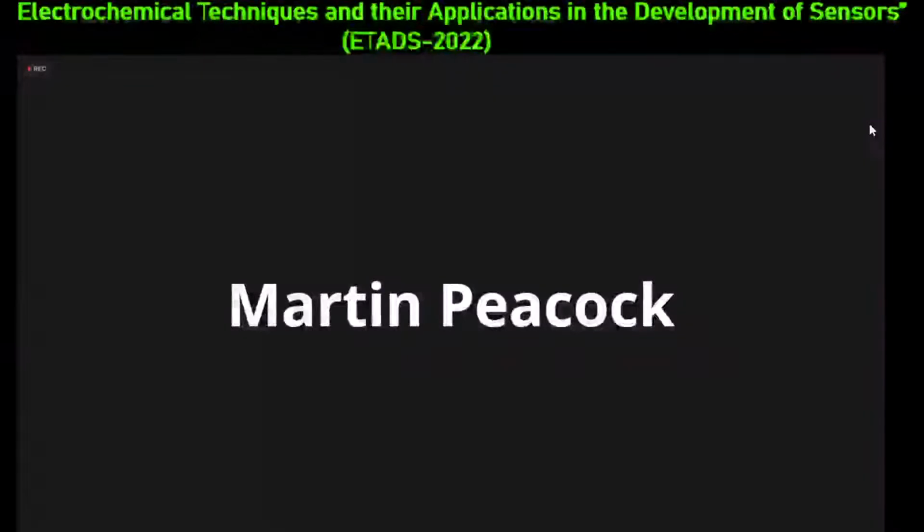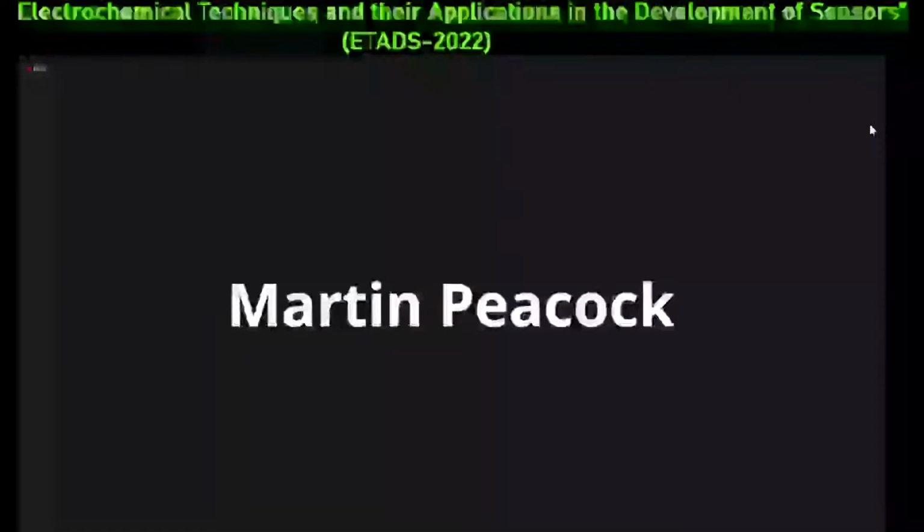And then you can run this kind of software. An experiment like that might take 30 seconds, depending on scan rate and on the voltage, but it's very, let's say, quick to do. And it's a very clean kind of experiment as well. To do that experiment, they needed a laptop, one screen printed electrode, and the particular potentiostat.